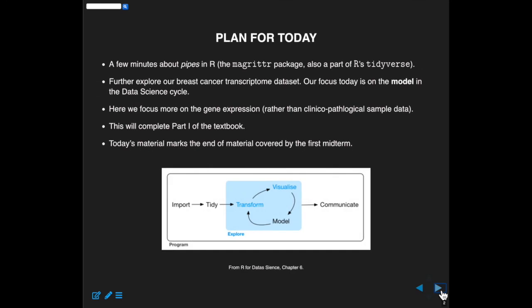So the plan for today, well, I'm going to start to talk about pipes in R because pipes are used in the textbook and often online in examples, so you need to know how to read them at least.